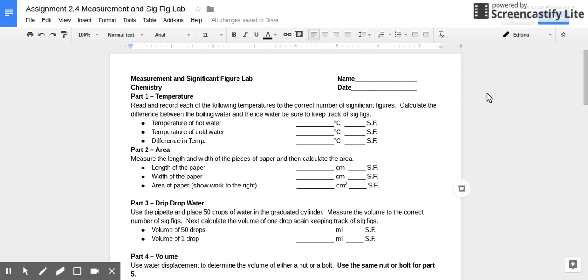So, folks, for people that aren't here, and also if I'm not able to be here today, for example fifth period, I'm going to give you a few instructions on how to do this lab. There are 8 stations in the lab in room 242. Each lab bench is marked with a number, and the materials that you need to do each one of these are at that lab bench.